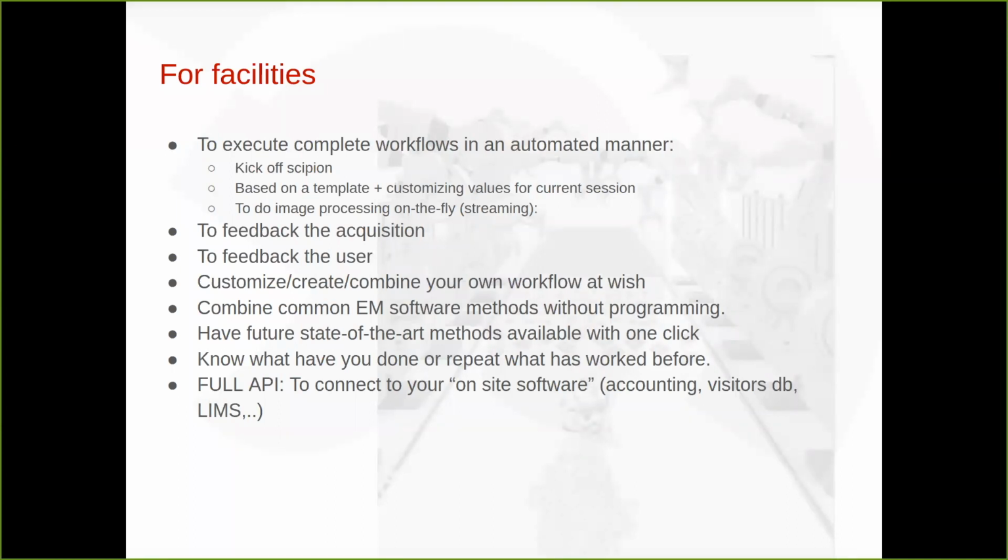So you can kick off a Scipion every day and launch your template script, and you can even customize a few values for the current session. Let's say you have a different dose, or you expect a different box size of the acquisition, you can customize your template.